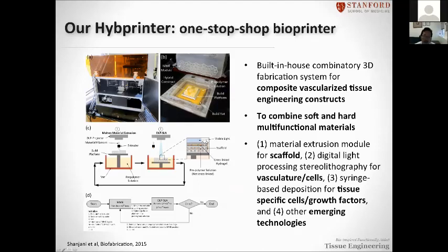Also, between the pores, you can use syringe-based printing to put other types of cells or bioagents there. So right now, if you read about bioprinting, they use syringe-based printing.